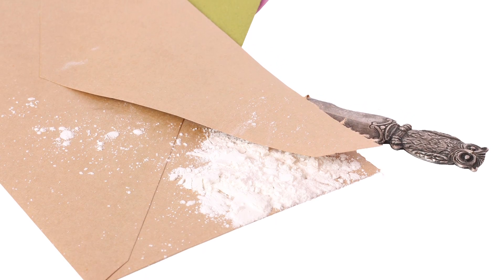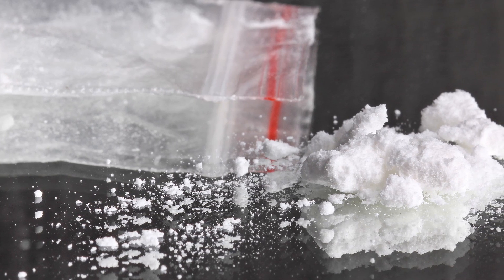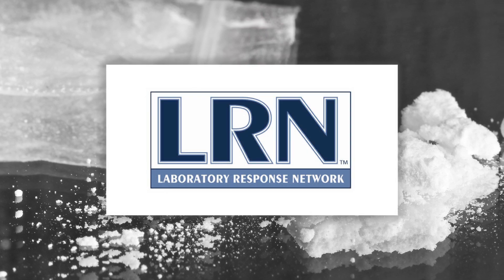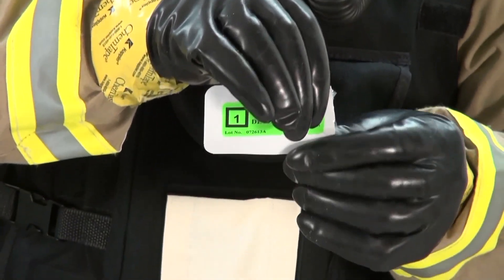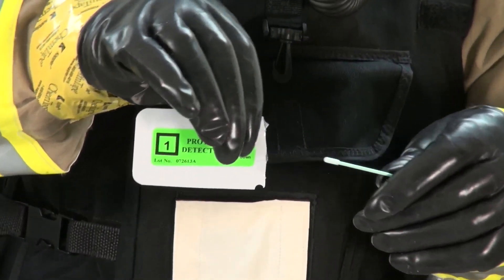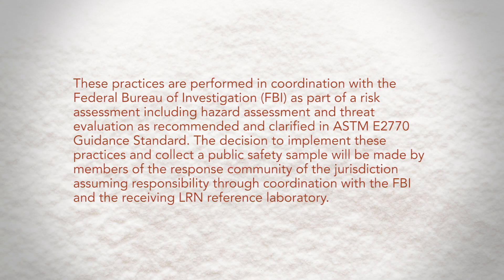If the source of the powder is a letter or small package, that item is also packaged in a manner that permits it to be safely transported to an LRN reference laboratory. A sterile moistened swab may be used to collect residual powder and may be used to conduct on-site biological assessments for the purpose of testing for biothreat agents. These practices are performed in coordination with the Federal Bureau of Investigation, or FBI, as part of a risk assessment, including hazard assessment and threat evaluation, as recommended and clarified in ASTM E2770 Guidance Standard. The decision to implement these practices and collect a public safety sample will be made by members of the response community of the jurisdiction assuming responsibility through coordination with the FBI and the receiving LRN reference laboratory.